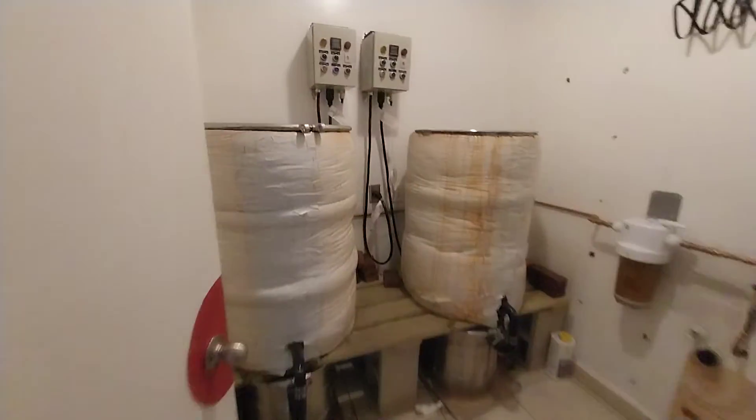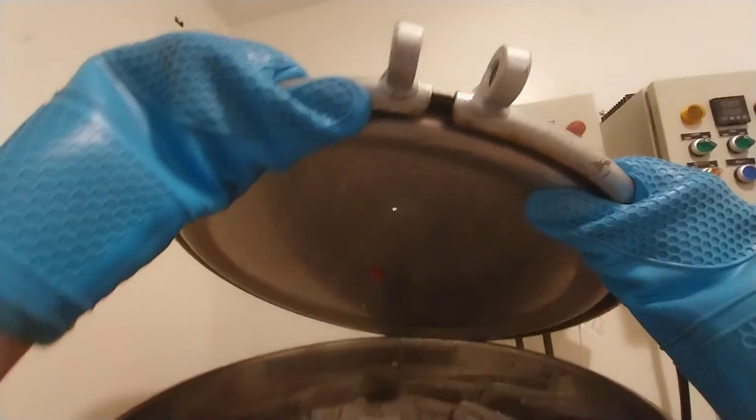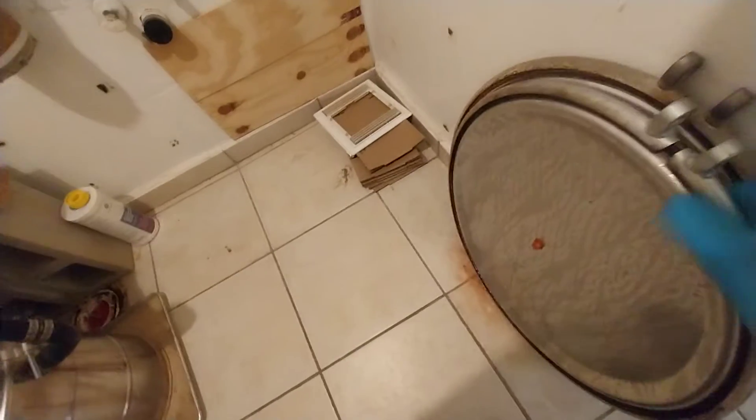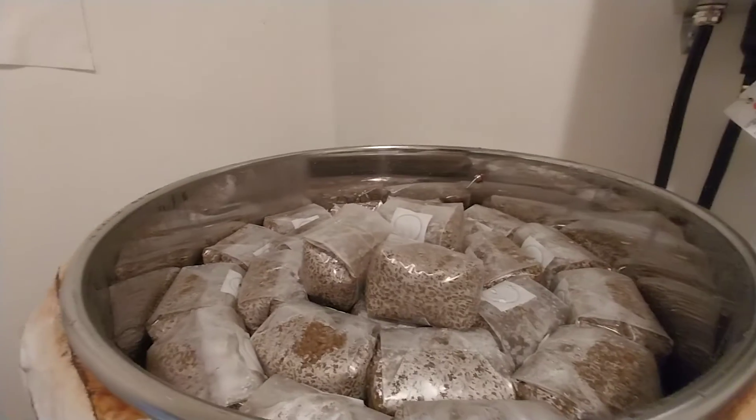Julian is cooking more liquid culture, and it is time to unload the sterilizer. And there it is — rye berries, people. Lots of rye berries.